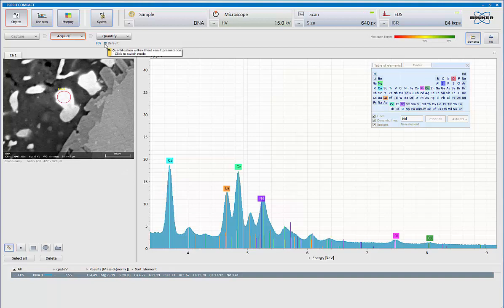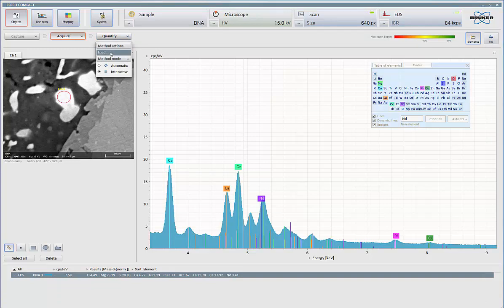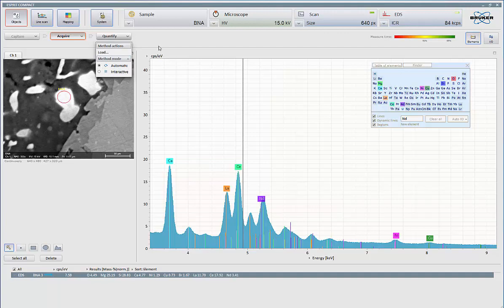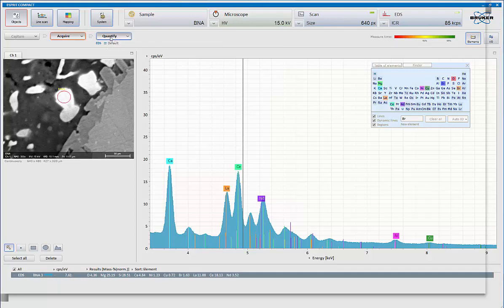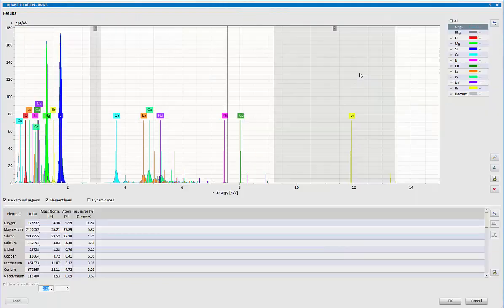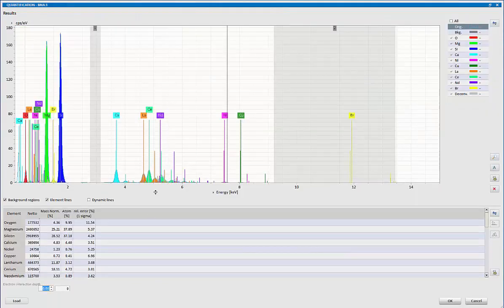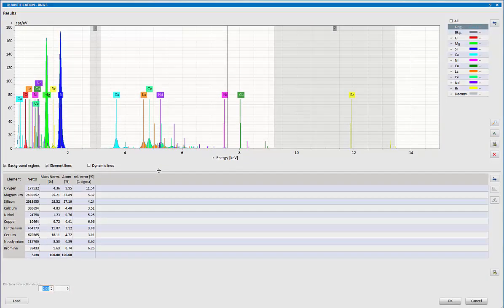So under quantify, if you have a down arrow key which allows you to load any of the other methods, it also shows you that if you're in automatic mode, rotary, this is a one shot analysis. So I simply click on it and it updates the display. If I click on it again so I get the parallel lines, this is an interactive analysis. So now this panel appears and it shows me down here what my quant results look like.